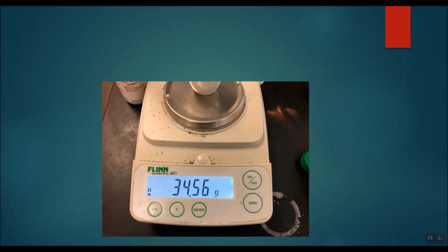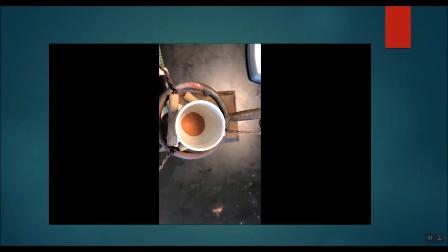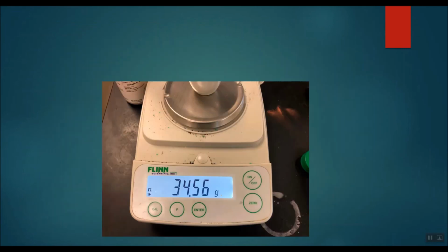So this is what I'm going to do. I am going to reheat it again, and I am going to let it cool off again, and then I am going to mass it again. Why? Because if I heat it up for, let's say, 5 minutes, 10 minutes, and the mass increases again, then that tells me something. That tells me that I did indeed have some copper that had not been reacted, and now that copper has gained the oxygen, therefore a gain in mass.